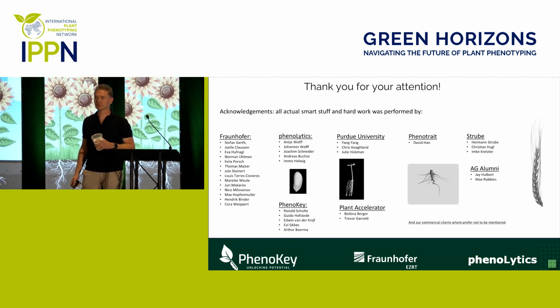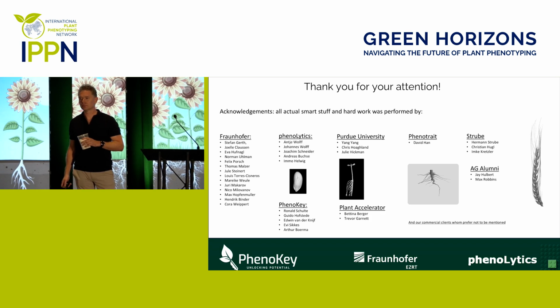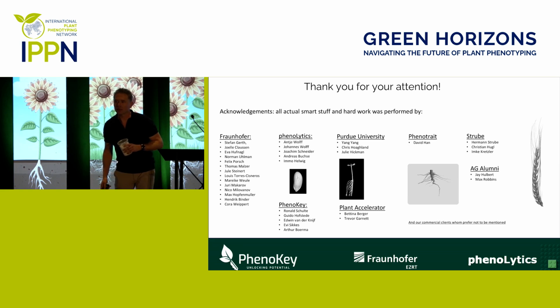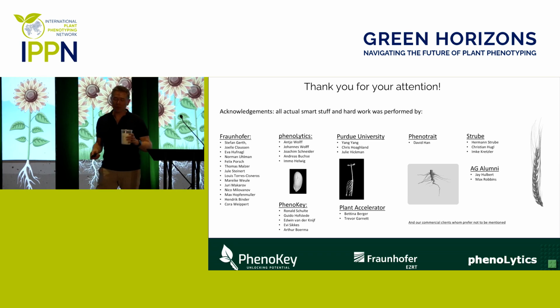Ambassador Richard Dick from the IPPN. Just in the field systems, the human safety aspect, how is that managed? Human safety, you said? Yeah, you've got X-rays flying around. Yeah. Good question. That's the important question.